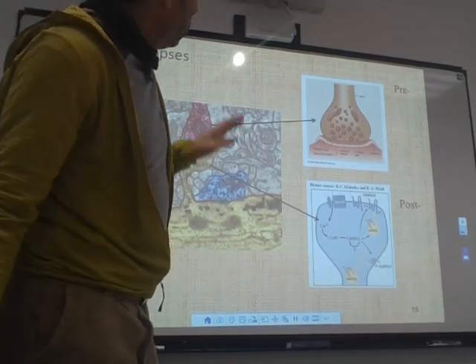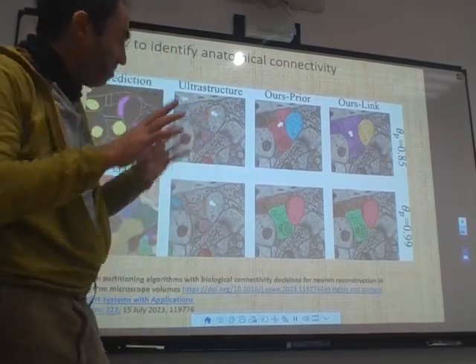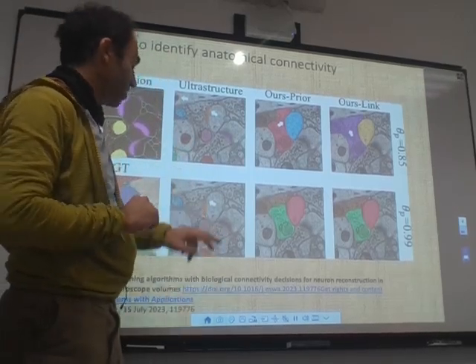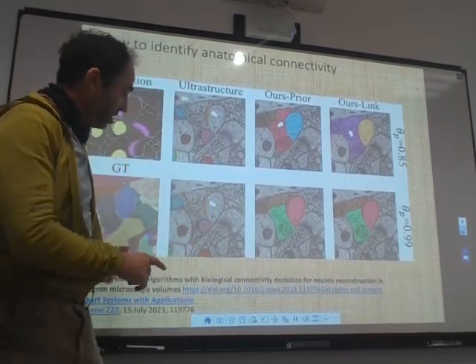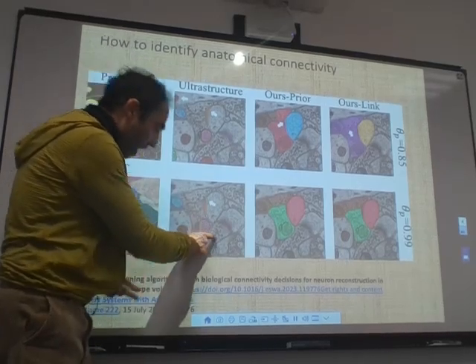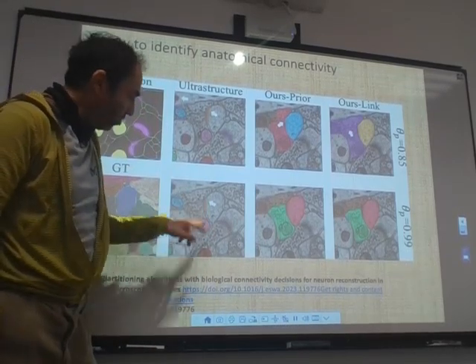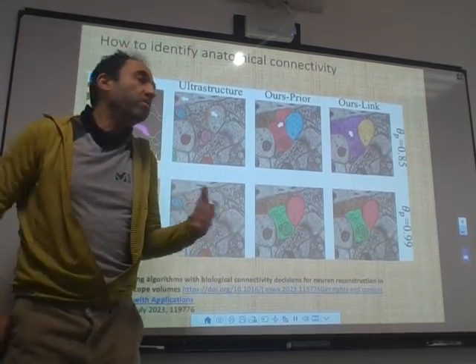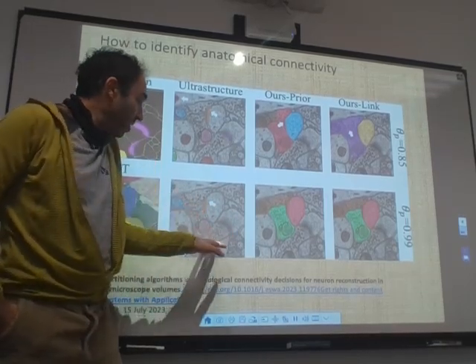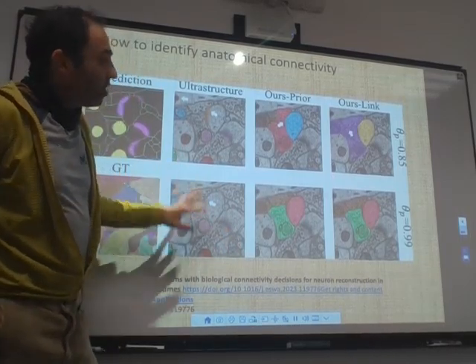So you want to identify features, put them somewhere, keep them, and look if this is reproducible, and between which cells. And you're also interested in, for example, do you have a mitochondria? Each time you have this, at which distance do you have this from your structure? Because if you don't have mitochondria, maybe there is not enough energy. And so what you are seeing is something that looks like a synapse, but maybe it's not functional enough. So you can go step by step.